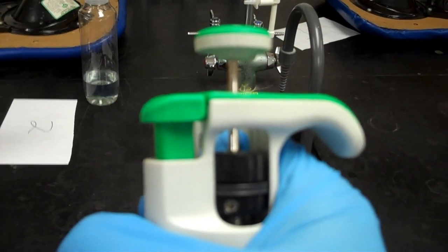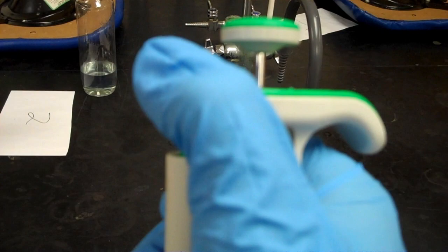Now that you're done pipetting, you must eject the tip. The eject button is here, hold it over the trash and hit the button with your thumb.